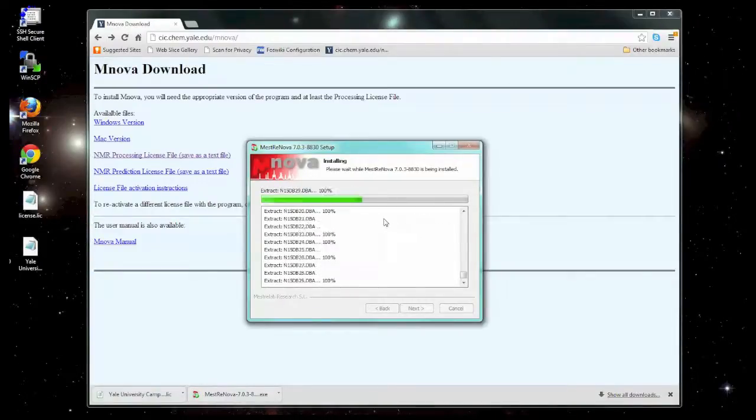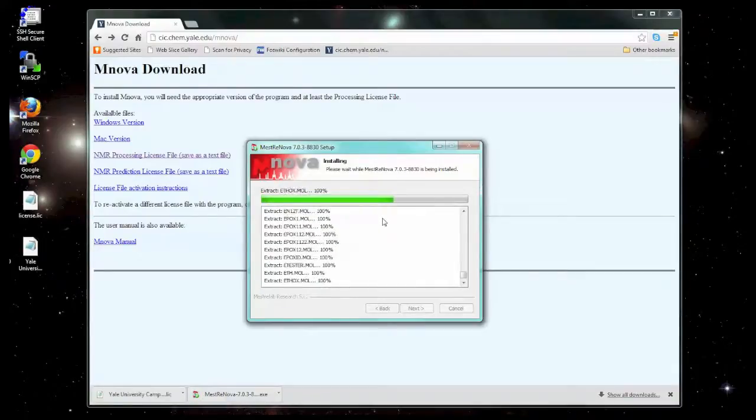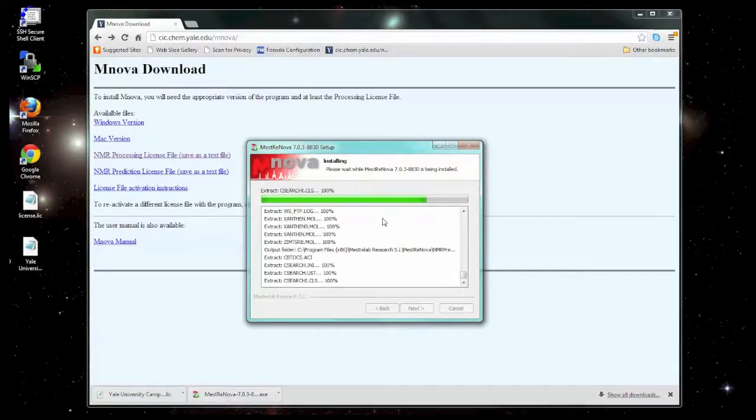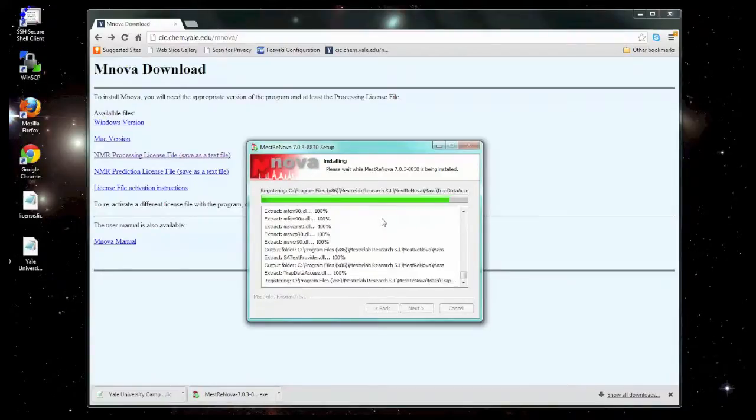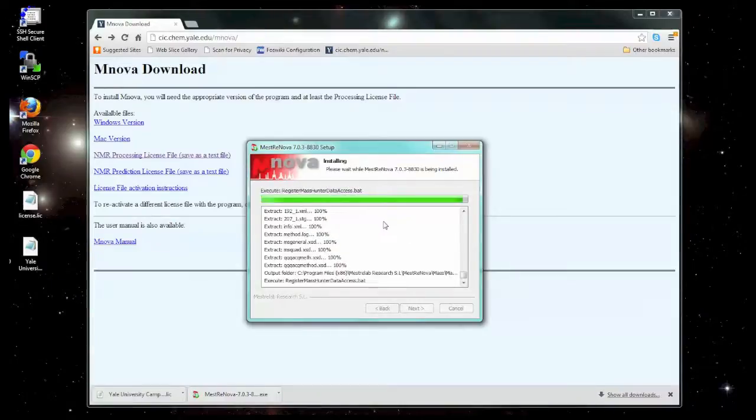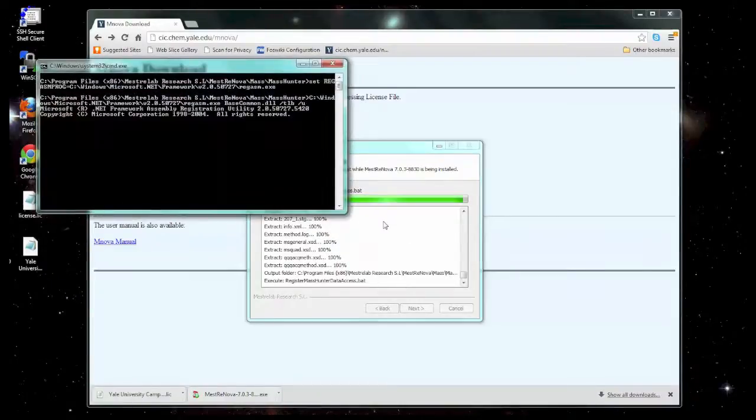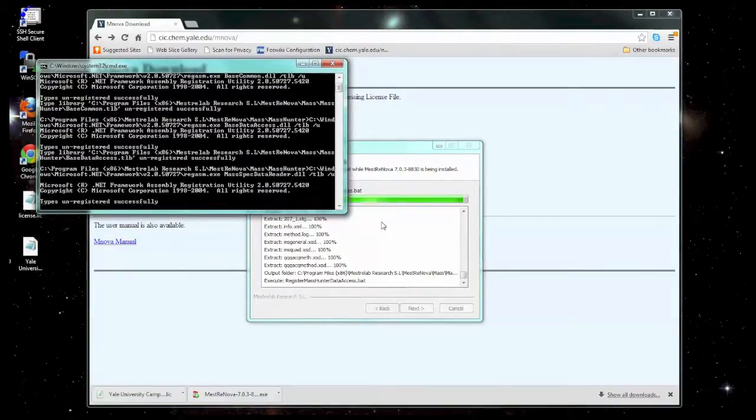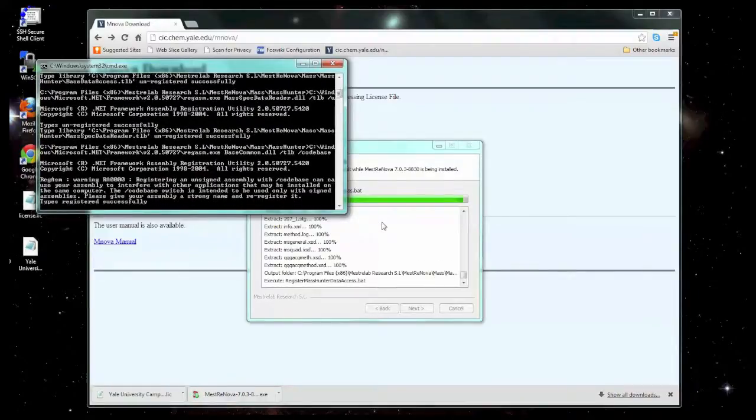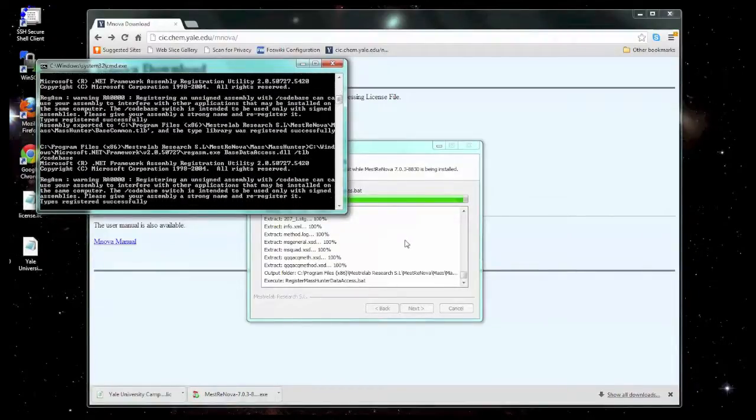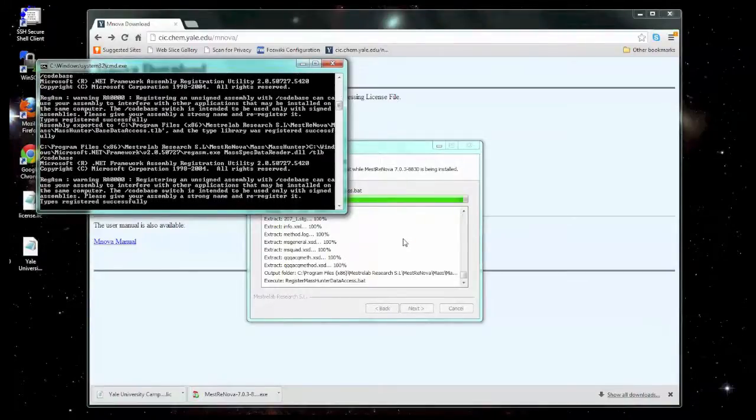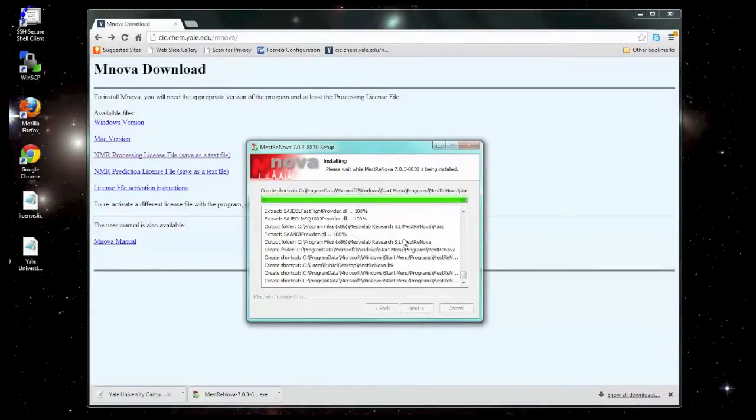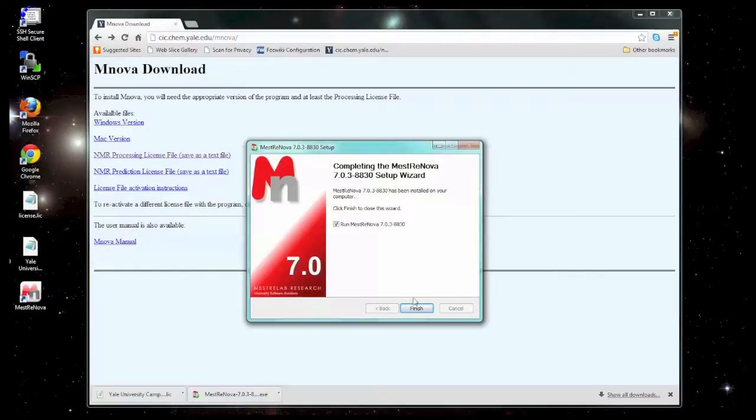It should give you the option to automatically open MNOVA and run it for the first time. First time you run it, you're going to need to activate the program. When you activate it, you're going to need to be connected from the Yale network. This means that if you're using wireless, you need to be connected from the Yale Secure wireless network, or you need to be connected to a wired network port on the Yale campus. If you have trouble activating, try connecting either through the VPN or through a different connection setting, because this is most likely the problem.